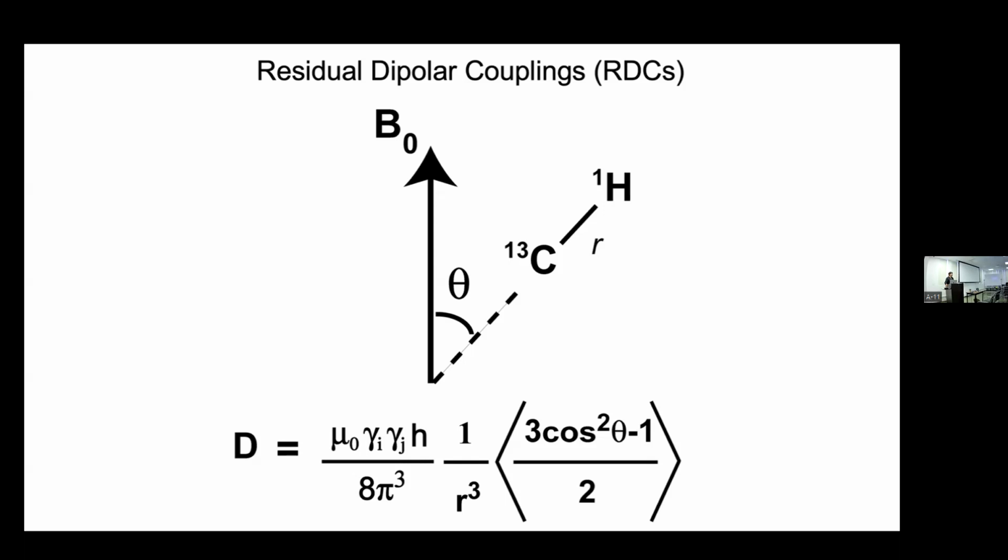Scalar couplings of the second kind. These are the anisotropic components of scalar couplings, which you normally don't observe, but there are people that are trying to, as Art said, investigate the consequences. They might have consequences for relaxation, but I don't think they are manifest as energy changes or changes in splitting. Yes, the scalar coupling can also be isotropic.